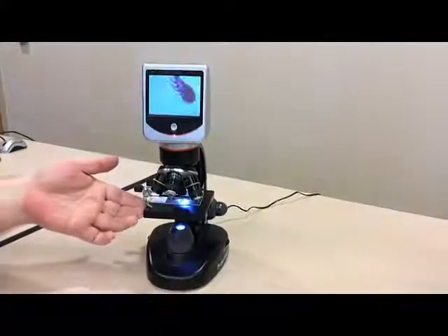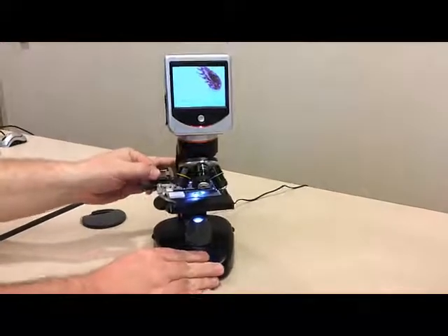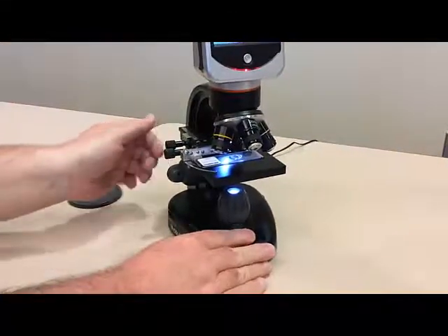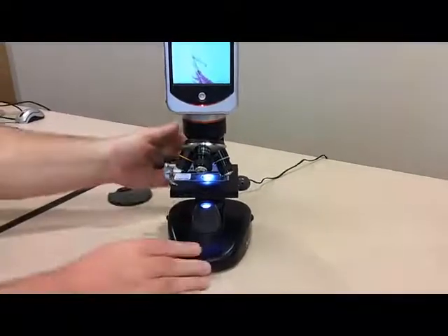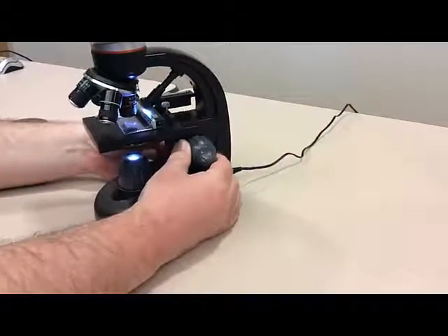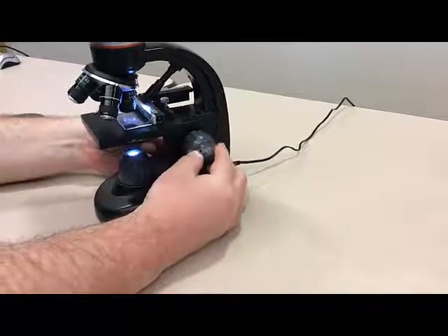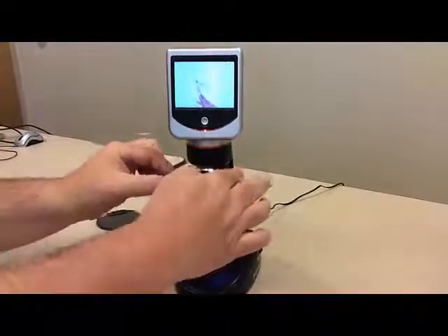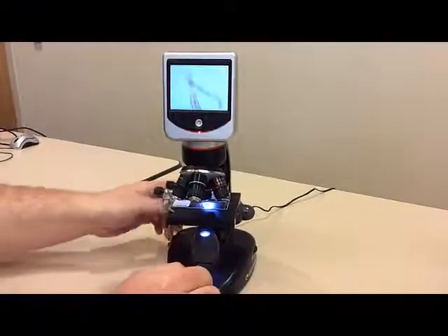Insert the slide onto the stage between the slide clamps. Use the knobs on the left side to adjust the position of the slide. Have students begin by using the shortest magnification lens, which has a red ring around it. The focus adjustments are located on both sides of the stage. Use the large knob to make significant adjustments and the smaller knob for finer ones. When an organism comes into view, use the lens with the yellow ring, which has the next higher level of magnification, to view it in more detail.